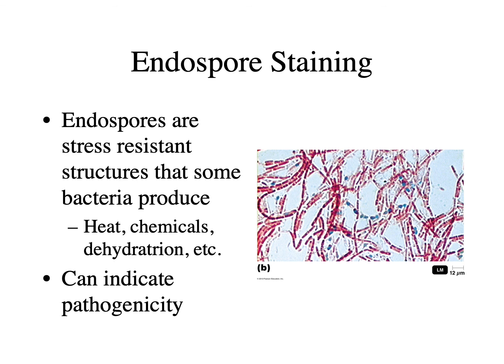And in this specimen, you can see that there's some red streptobacilli. Those are bacteria. But the little green circles are little endospores that formed from bacteria that were so stressed out that basically they formed an endospore and then they disintegrated. So this is another kind of Christmas-colored slide where you can really see the difference between the green and the red, and if you see the little green circles, you know that this is capable of endosporulating.